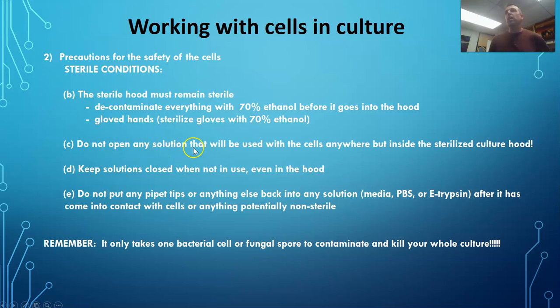Another thing is don't open any solution. Media is very good for things to grow in, so if you open it up out in the air, bacteria are going to grow in it. So we're only opening those things in our TC hoods and so forth. Keep solutions closed as often as possible, and again, don't open them anywhere except the hood.